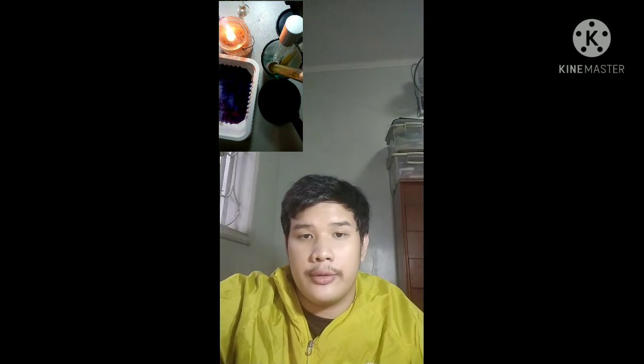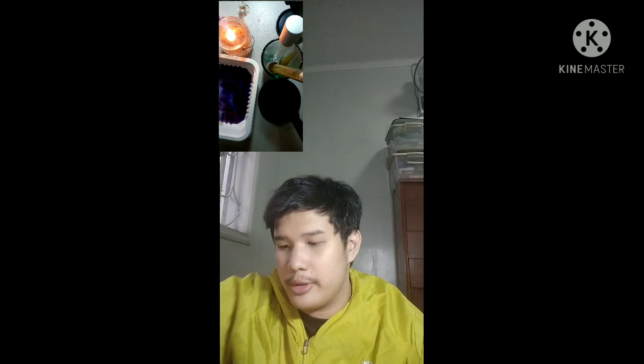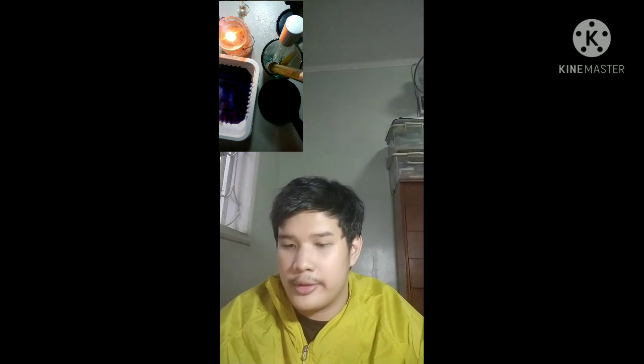And we will now observe the samples under oil immersion microscopy. That's it for this episode of Kyle Learns Microbiology. I hope you learned something, because I did.